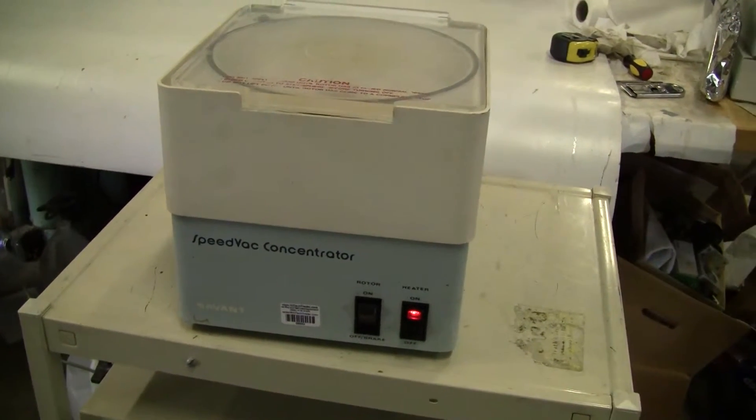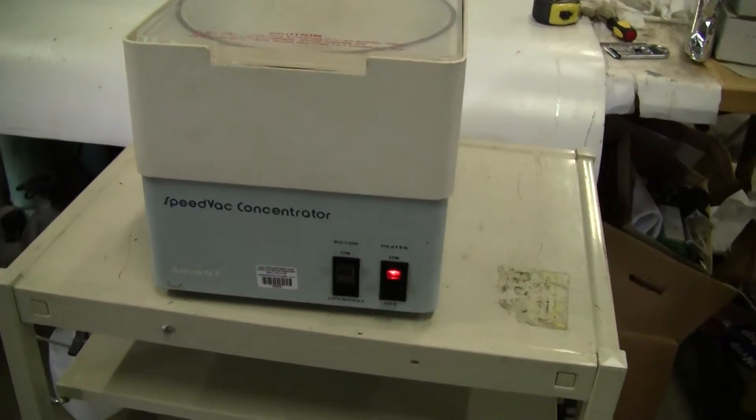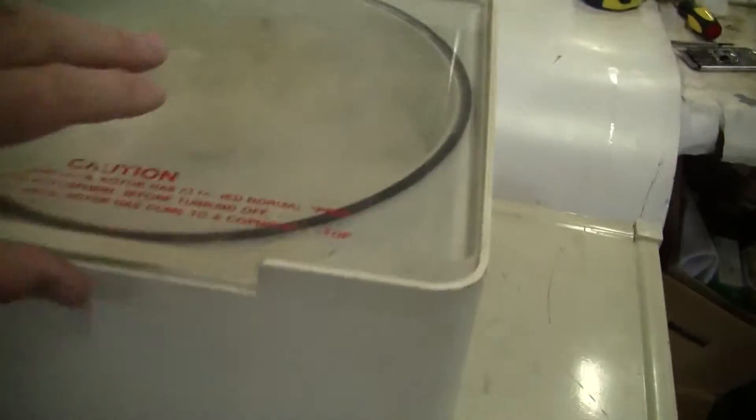Hi, this is Jim from High Tech Trader. We're looking at a Savant SpeedVac Concentrator. It has a model 1228 rotor. If this isn't the rotor you want, let us know — we have a couple others.